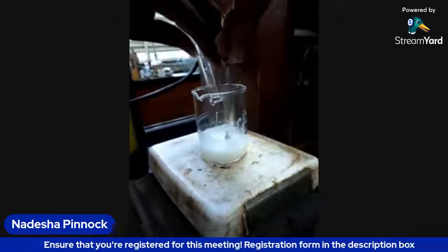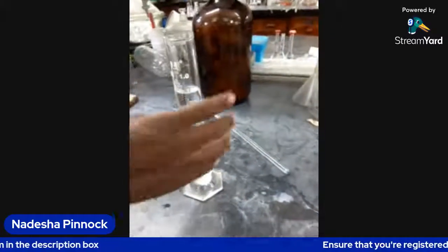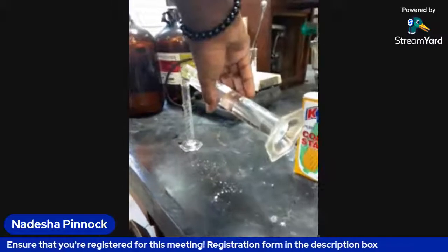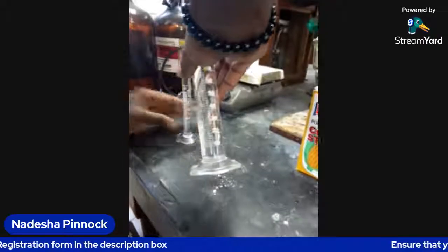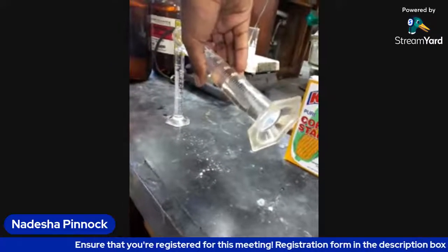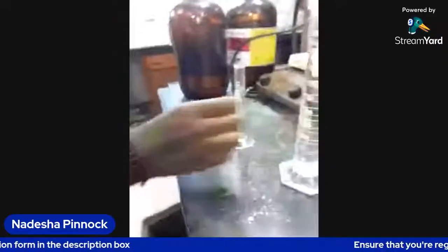And then we're going to add about 5 mils of our 6% acetic acid, which we made up here. We made up 100 mils of it. So we're just going to add about 5 mils of it, measuring it out. And then we're going to add it to our mixture, stir it, make sure it's homogeneous. And then we're going to add it to our heat source, which would be our hot plate.